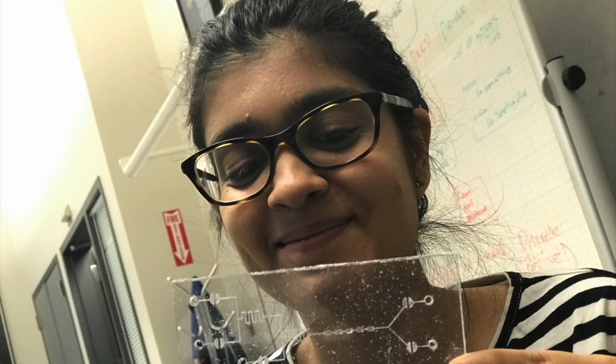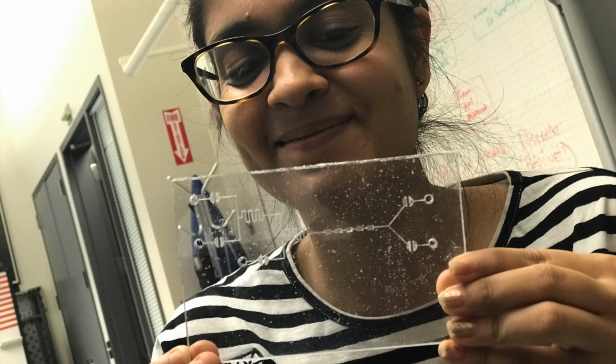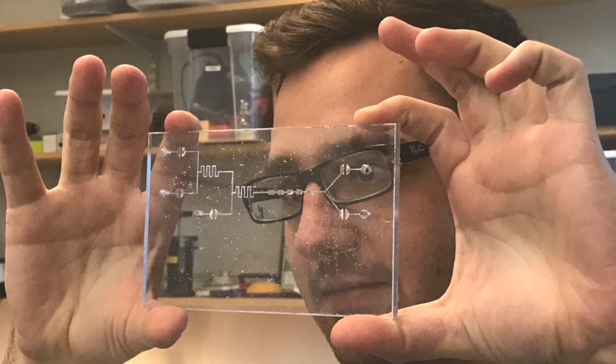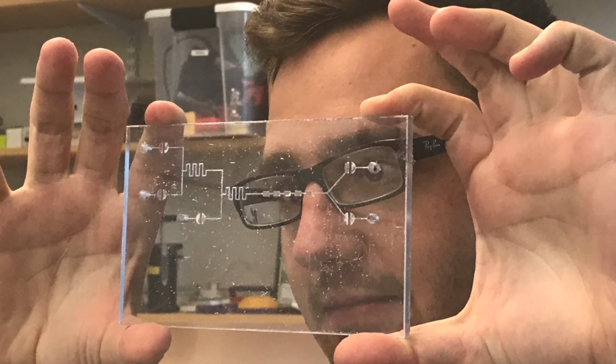Going briefly back to our microfluidic device, at the conclusion of our project we identified a few points for further development. First, we saw potential in adding multi-level primitives that could assist with air bubble capture on initialization, and finally improvements to cell visualization by components with areas less likely to capture cells.